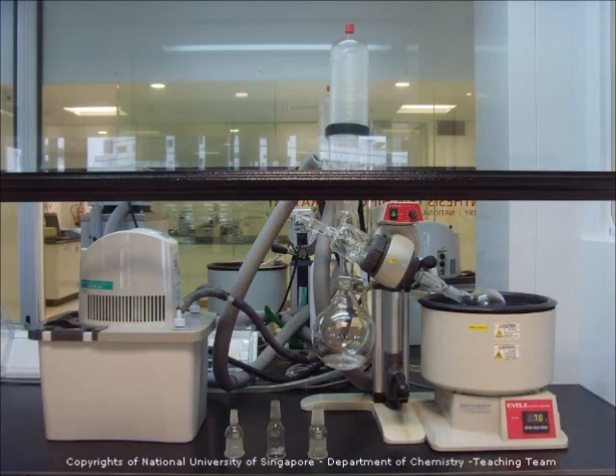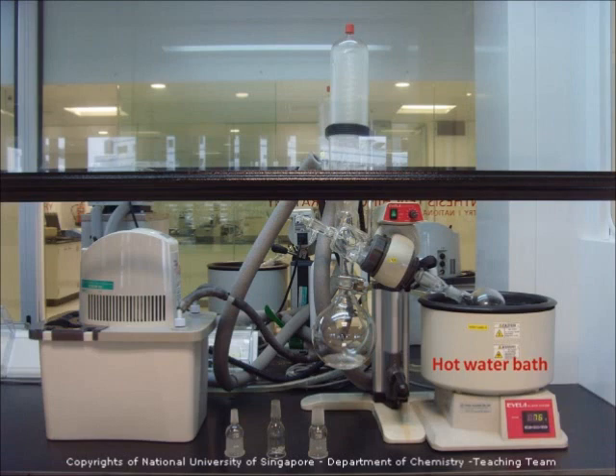There are a few components to this setup. A hot water bath to warm the flask that has your dissolved materials. Since evaporation is an endothermic process, you have to add a little heat to evaporate the solvent. The adapter connects the round bottom flask to the rotary motor.